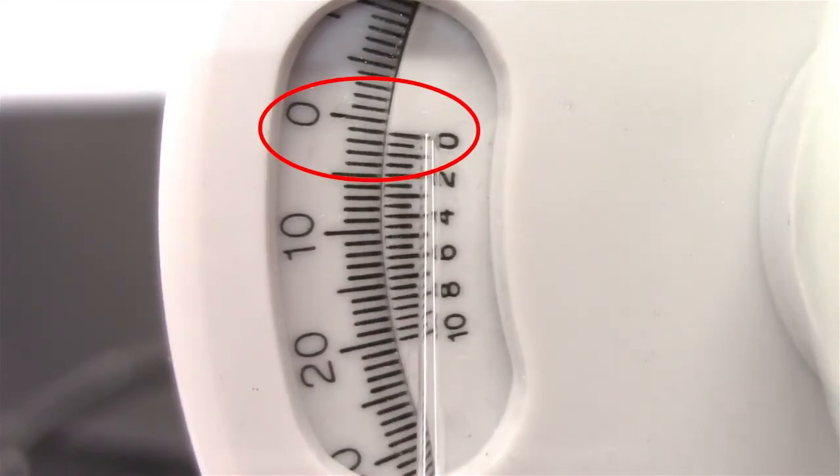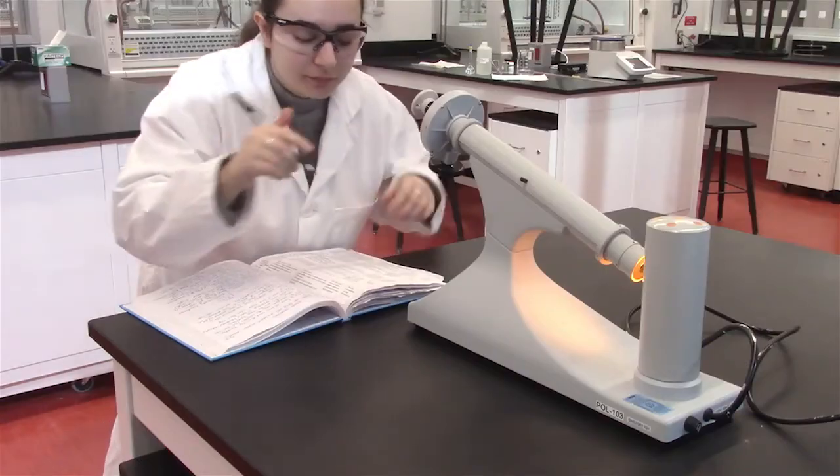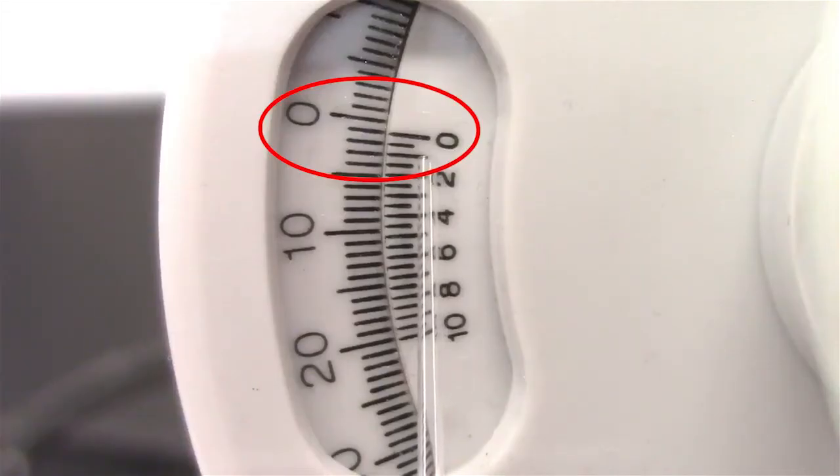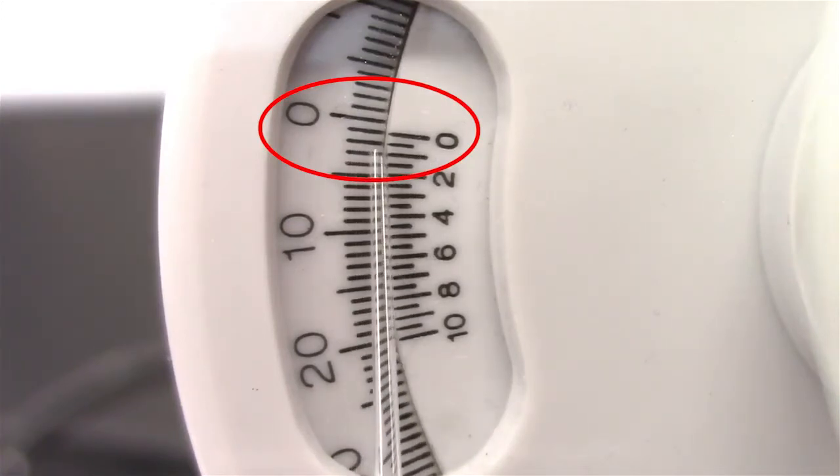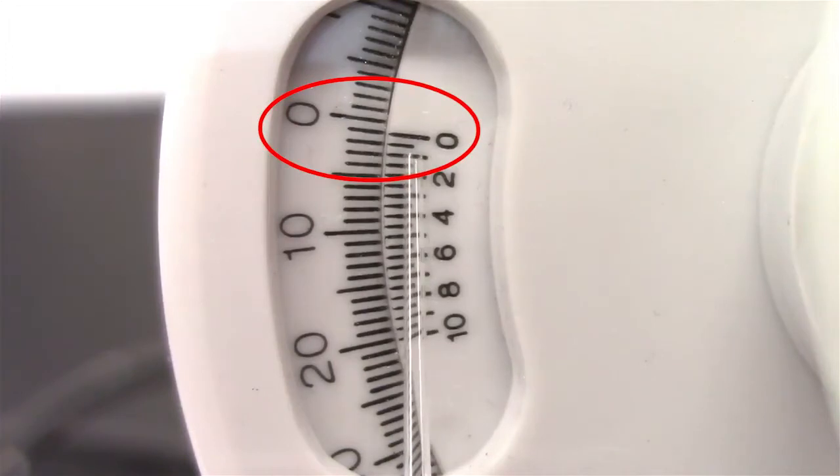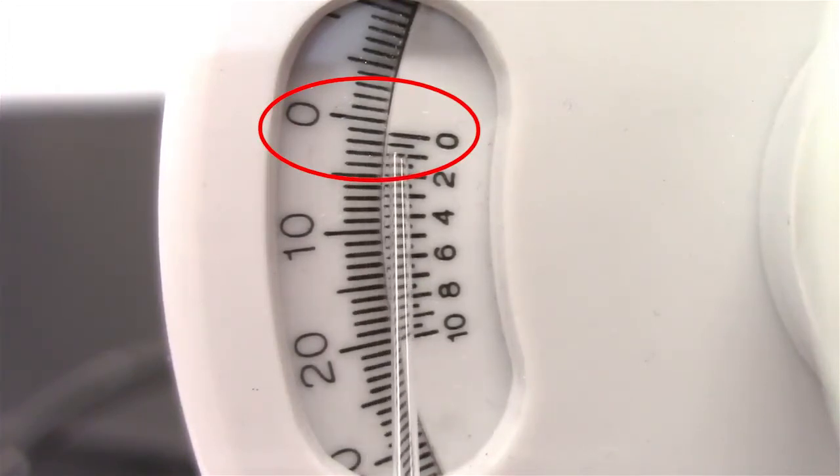In this example, the whole number is 1. To note the decimal, see where a line in the inner scale matches up with the line on the outer scale. In this example, the decimal number is 1.